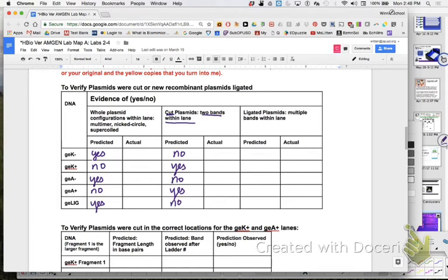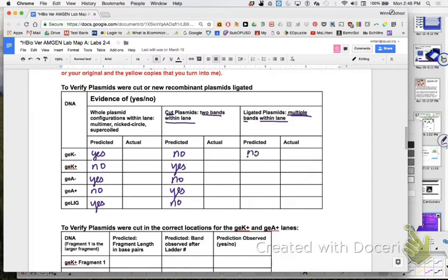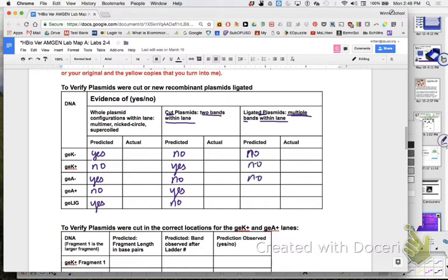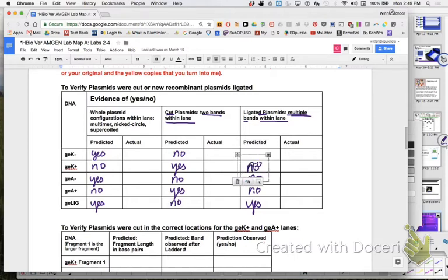And then you have to look and just write yes or no. Did that happen for you? Here. Ligated plasmids with multiple bands within each lane. I would say no to this because I don't have multiple. I just have my multiple skids. This is saying any combinations. So I would say no here. Should my K plus have ligated plasmids in it? No. No. Yes. And then actual yes or no. Did you get that? We good on data table one?